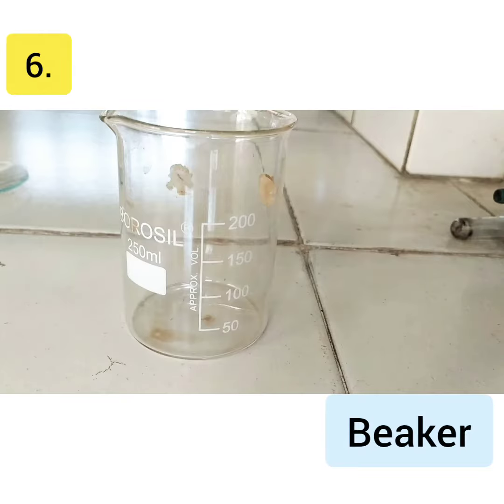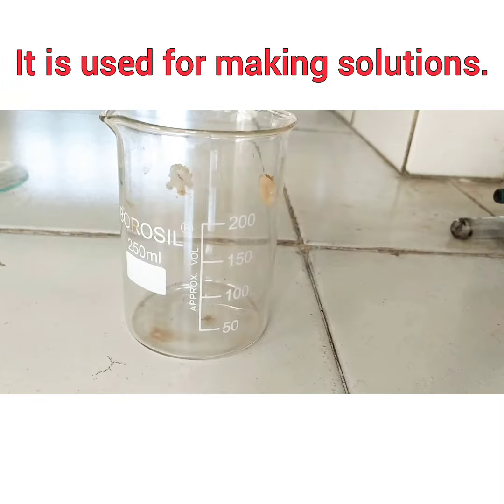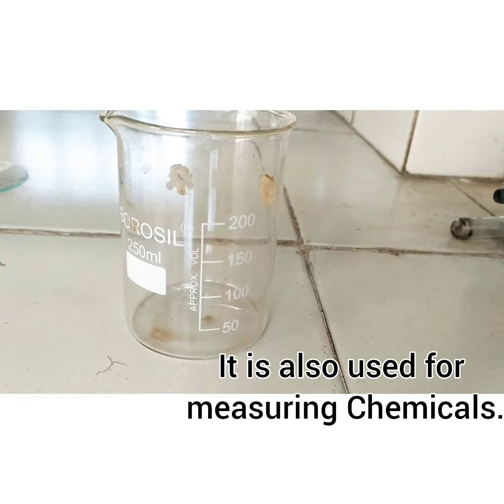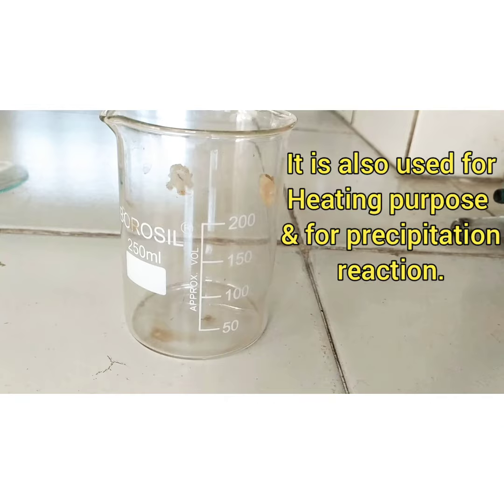Number 6. Beaker. It is used for making solutions. It is also used for measuring chemicals. It is also used for heating purpose and for precipitation reaction.